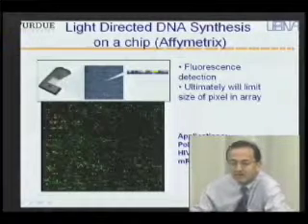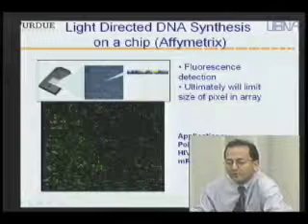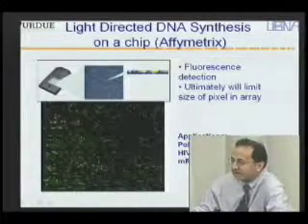And the applications here are numerous. Polynucleotide arrays for HIV sequencing, mRNA expression monitoring. This is really now, these arrays are used a lot for expression analysis.